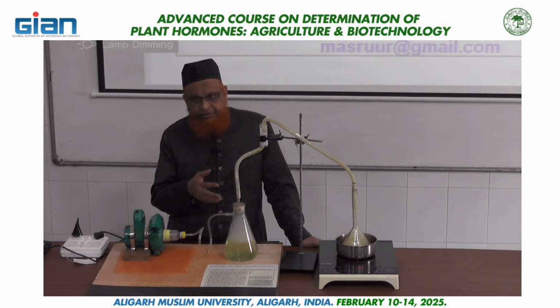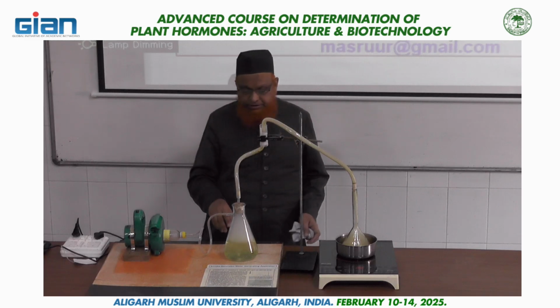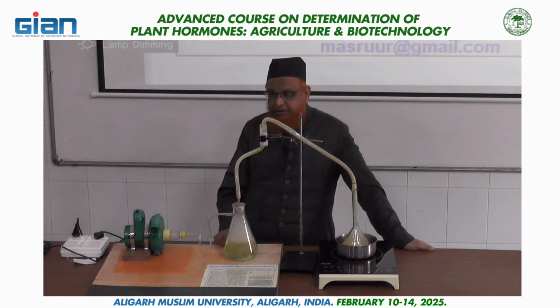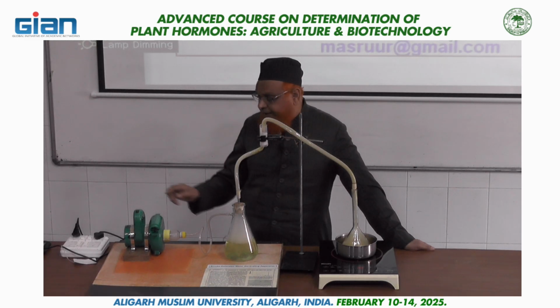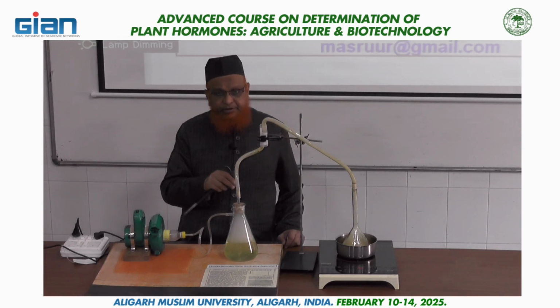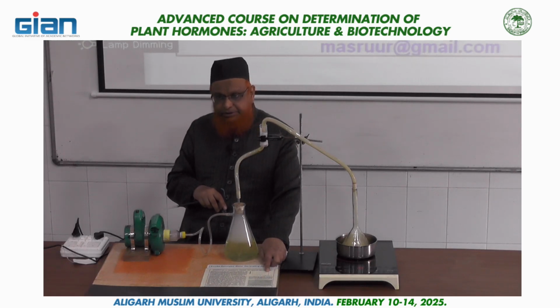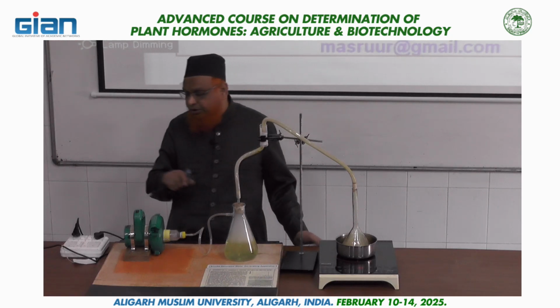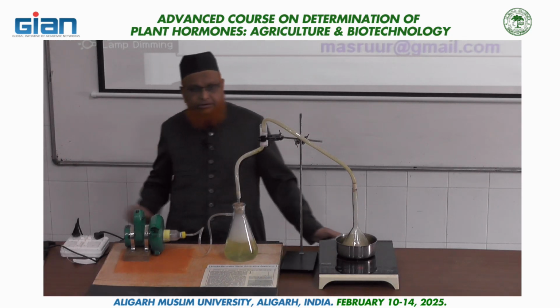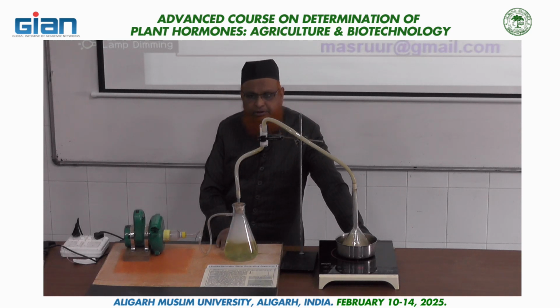If the rate of generation of smoke is high, you can increase the speed. Okay? You can see the water is yellowing in color. So take a sample of 500 microliters after 5 minutes. Okay? And make a graph like this. When saturation occurs, there is no increase in optical density, stop. And now your water is ready, called smoke saturated water, SSW, and you can use this for your treatment.